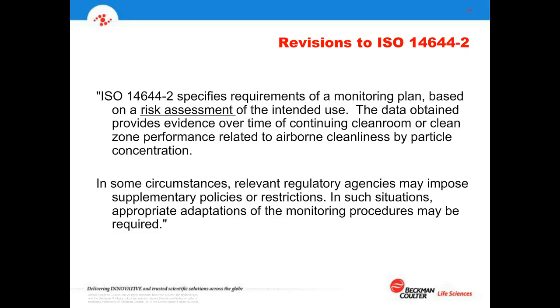And in this document, though, we do mention that, yes, there could be some regulatory agencies that have different methods. So we'll touch briefly, as we finish this talk, about the GMP documents, the Annex 1 and so forth, that many people in the biopharmaceutical industries need to address. So it says there might be some other things that even supersede this. There's a general discussion of monitoring and things to consider, think about, and plan for, but there may be other methods and controls depending on your type of industry.